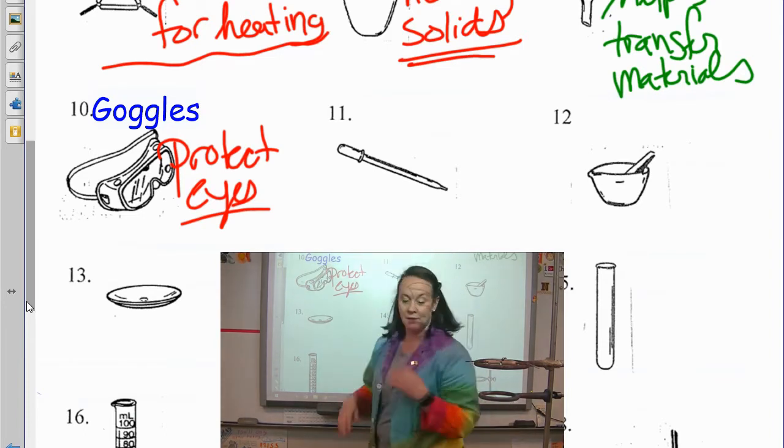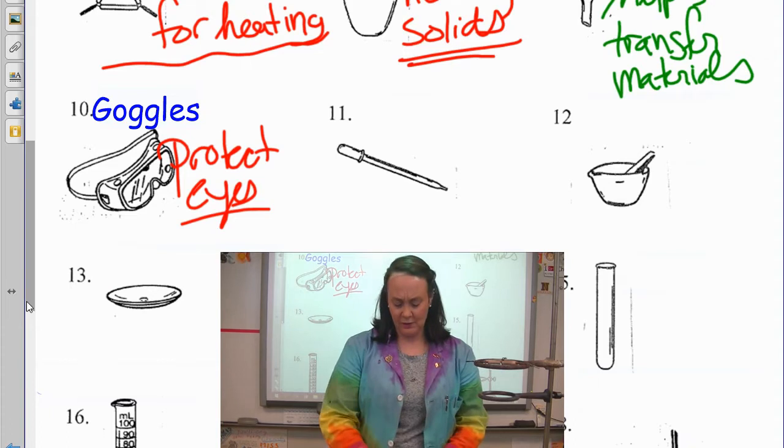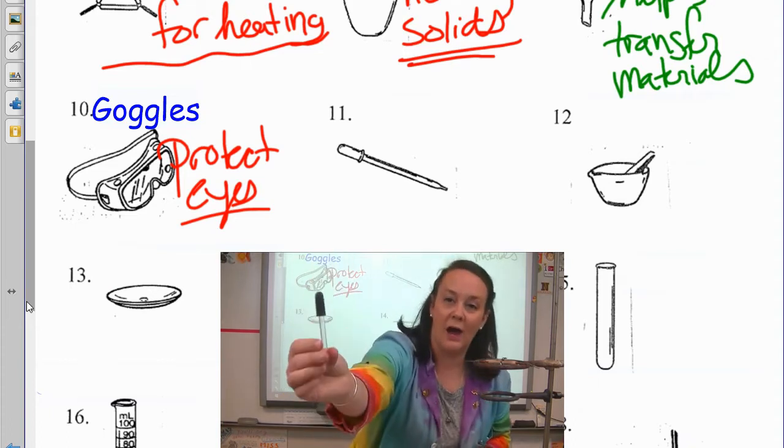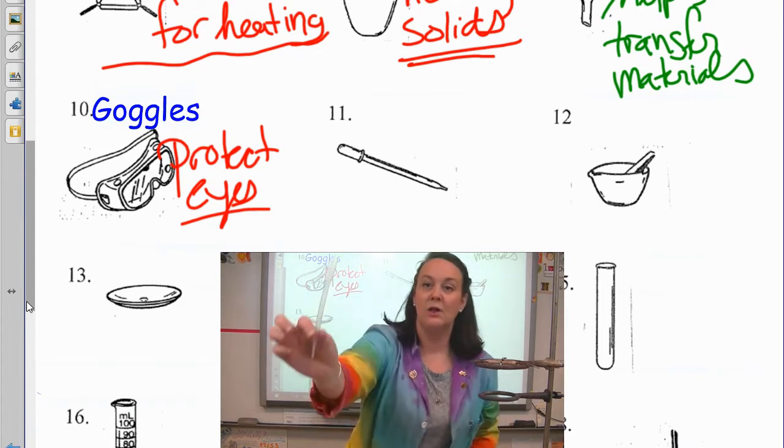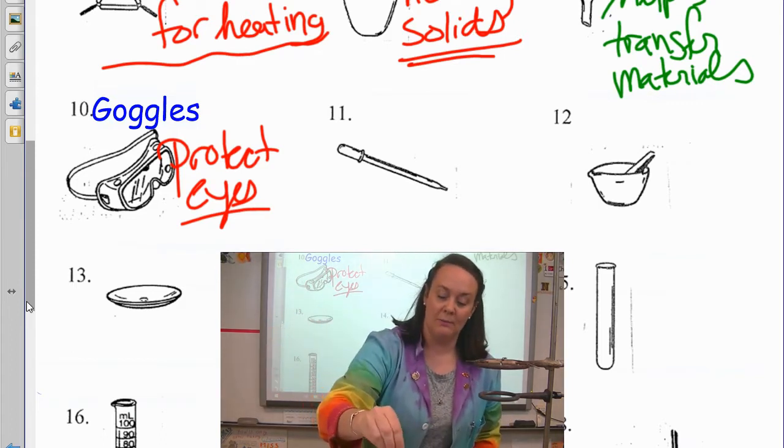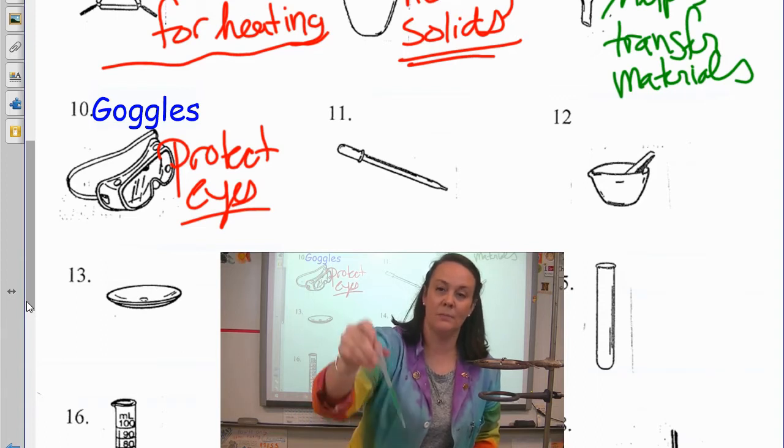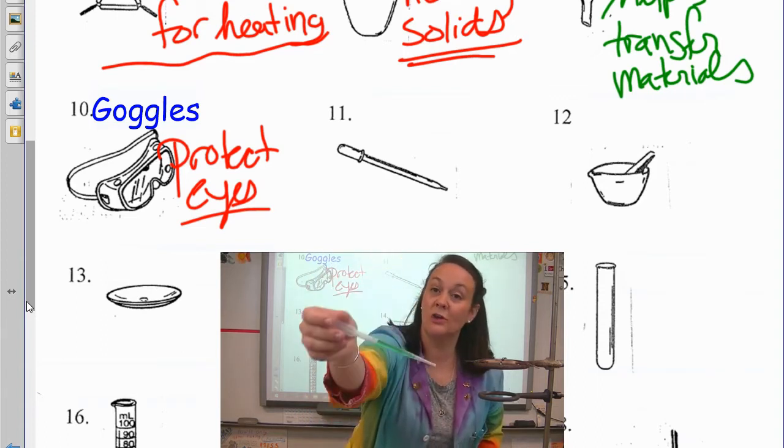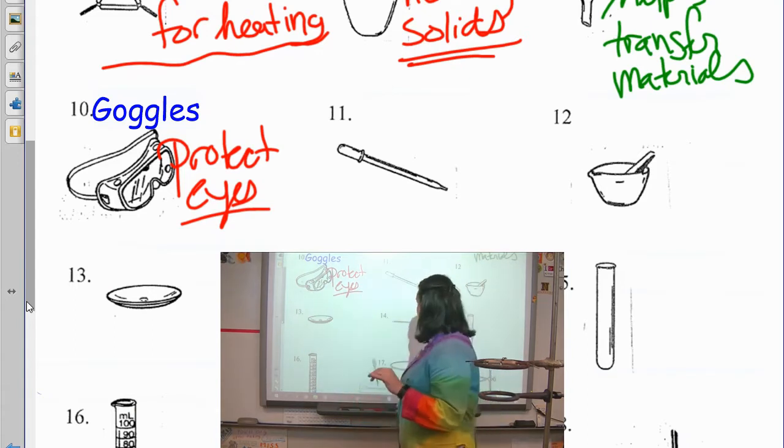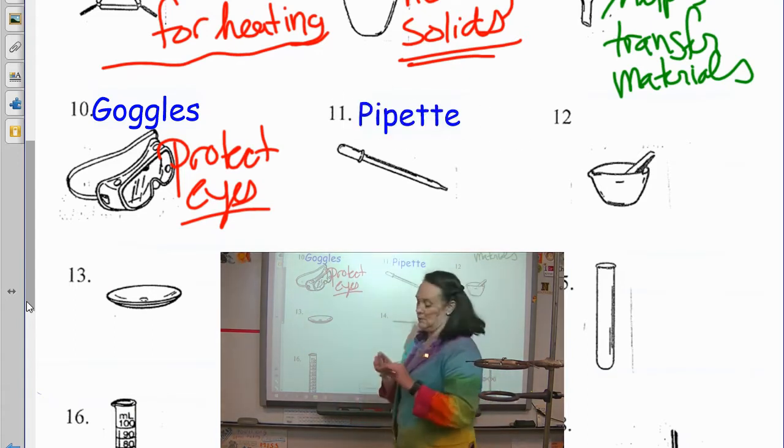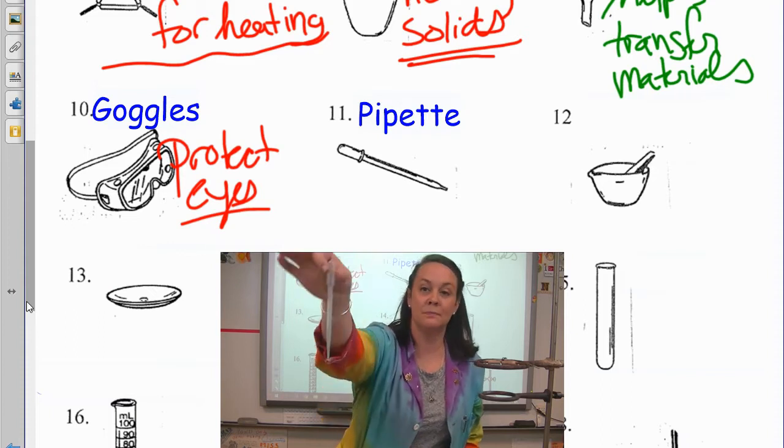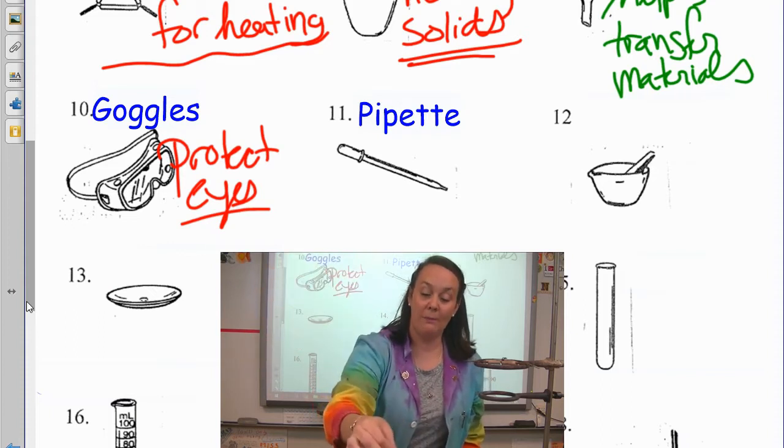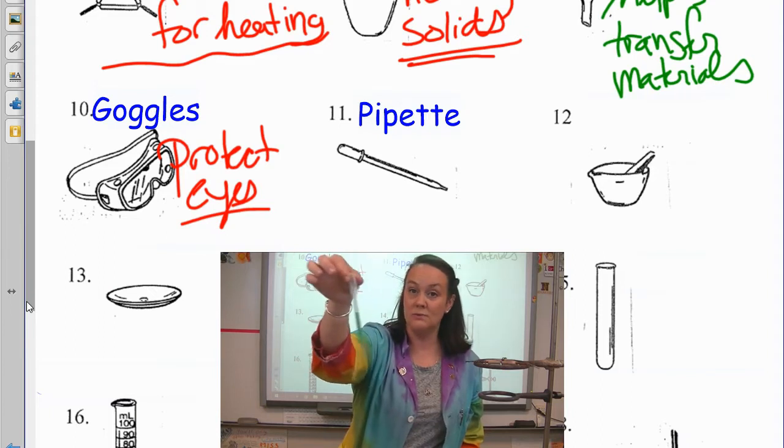The next one, there are actually two types here. I find the biology seems to use the eyedropper a little bit more. We don't necessarily call them eyedroppers here in chemistry. We use the plastic ones. I'm going to put some color in there. And this is what this is called. This is called a pipette. A pipette. That you guys just saw. It looks to me like an eyedropper on there. But what I'm looking for is this is a pipette.